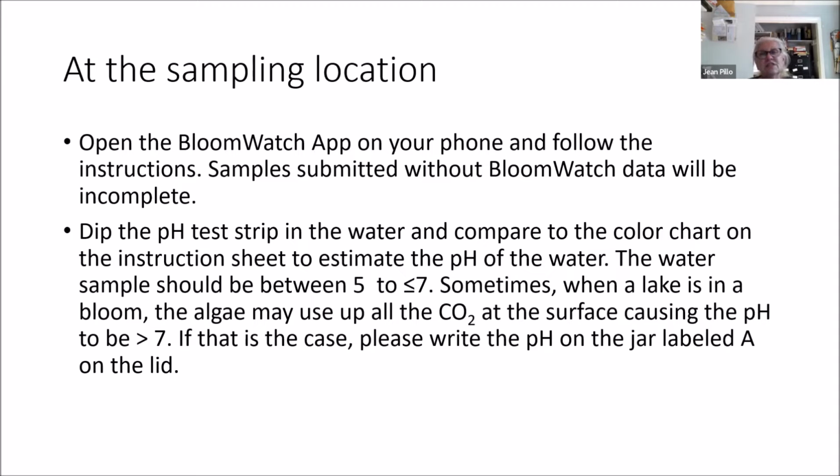And if the pH is high in your sample, they have to adjust it. So on your jar that has an A on the top, you need to write that information on the lid of that jar. Any questions about that?